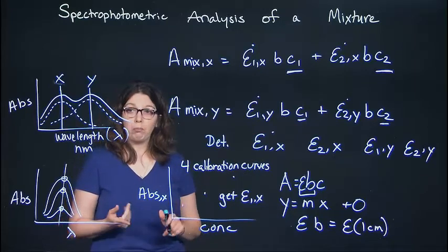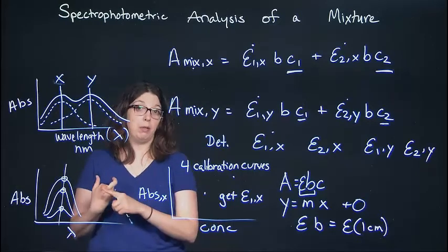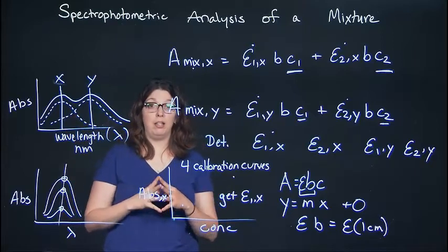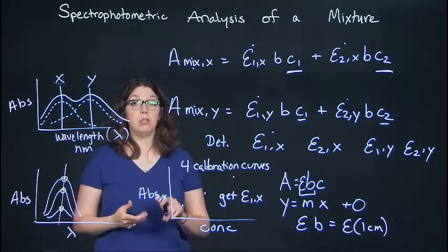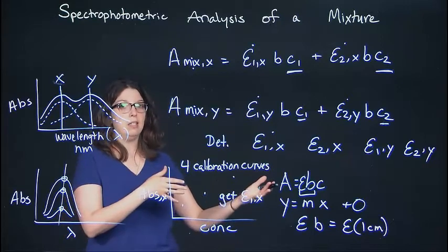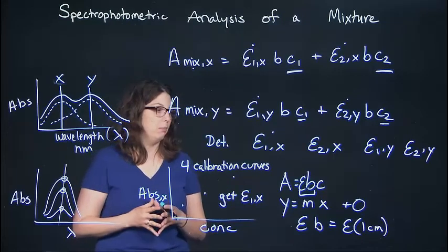A couple other things to note. How to use the instrument will be explained by your TA, but there will also be a brief document at the instrument to help you get started. And when you're measuring the absorbance of the mixtures, please do that in triplicate, so measure it 3 times. That way you can get statistics at the end for comparison of the different solutions that you're going to measure.